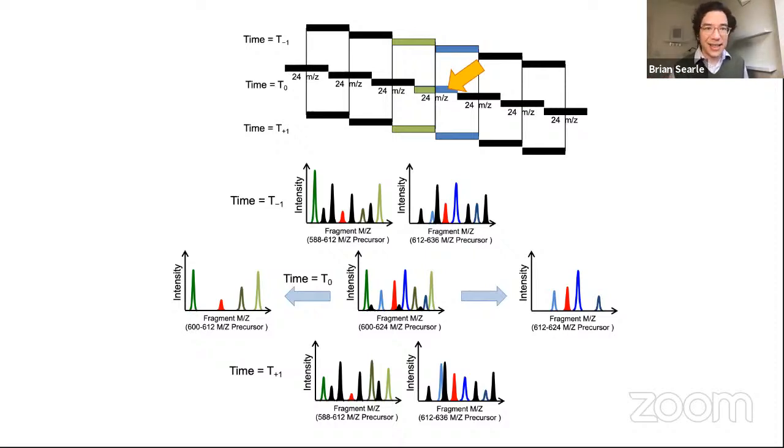It's actually a lot of the same type of math that we're doing here with these fixed scans with the Orbitrap. You can't do a scanning Orbitrap essentially because the Orbitrap is too slow. So those are great questions.